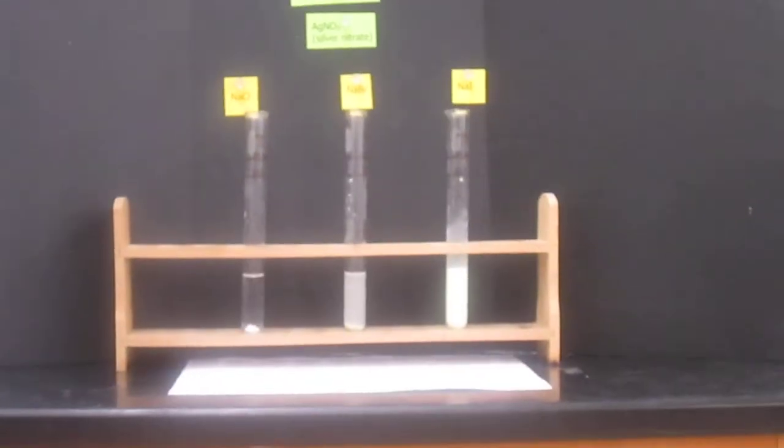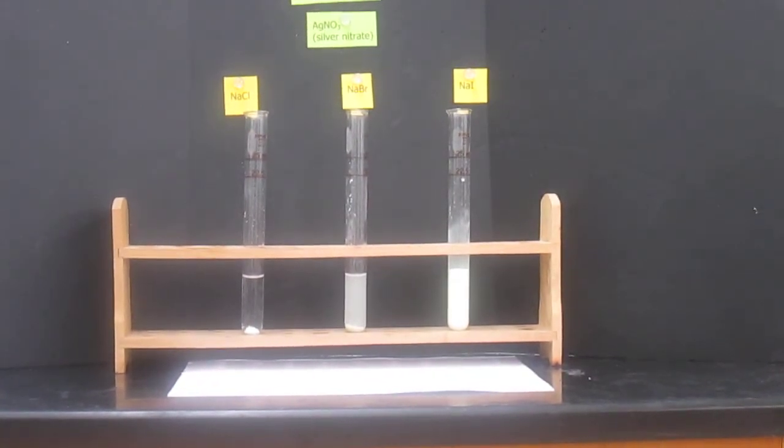So you can see that the majority of the liquid is clear, and we have a little bit of our solid left, but considering how much we started with, not a lot. There's our second one. Still have quite a bit of our solid left. It's not as clear in the liquid layer. And then our third one. We haven't lost anything. None of it has gone away. Okay, we'll add another dropper full.